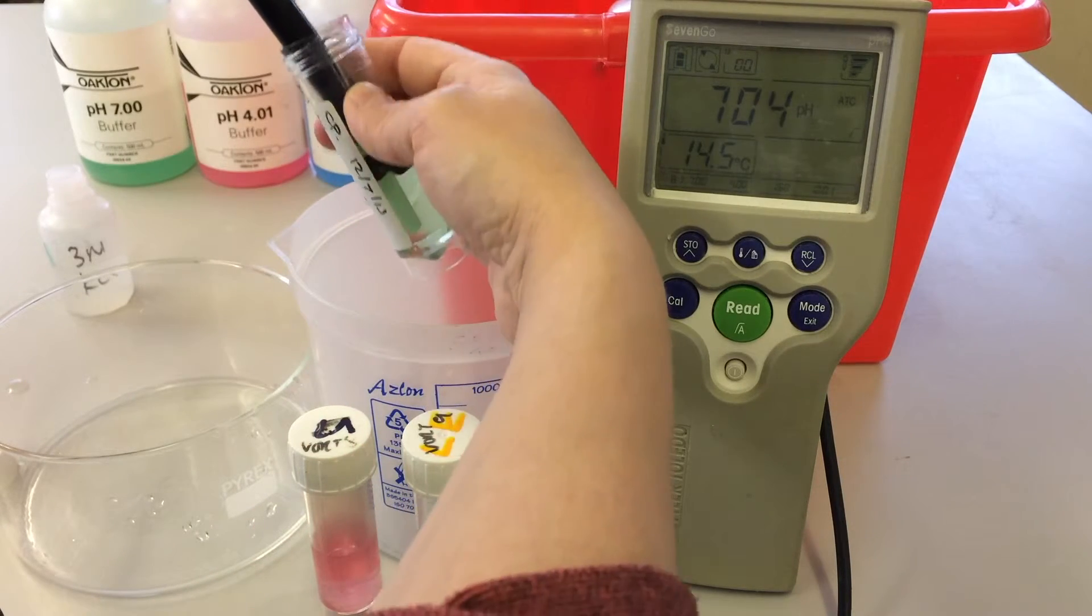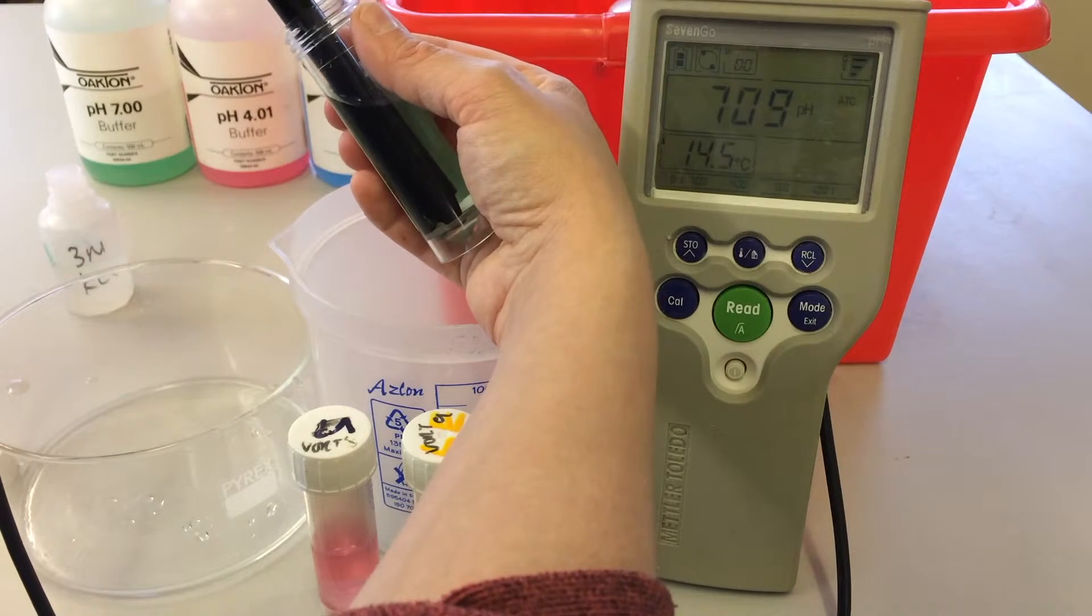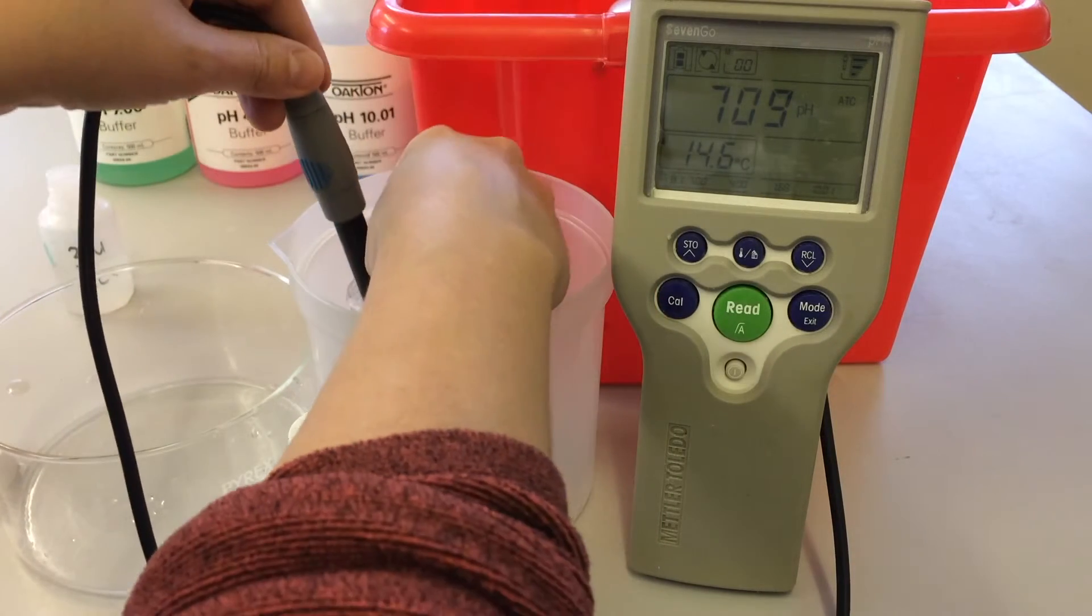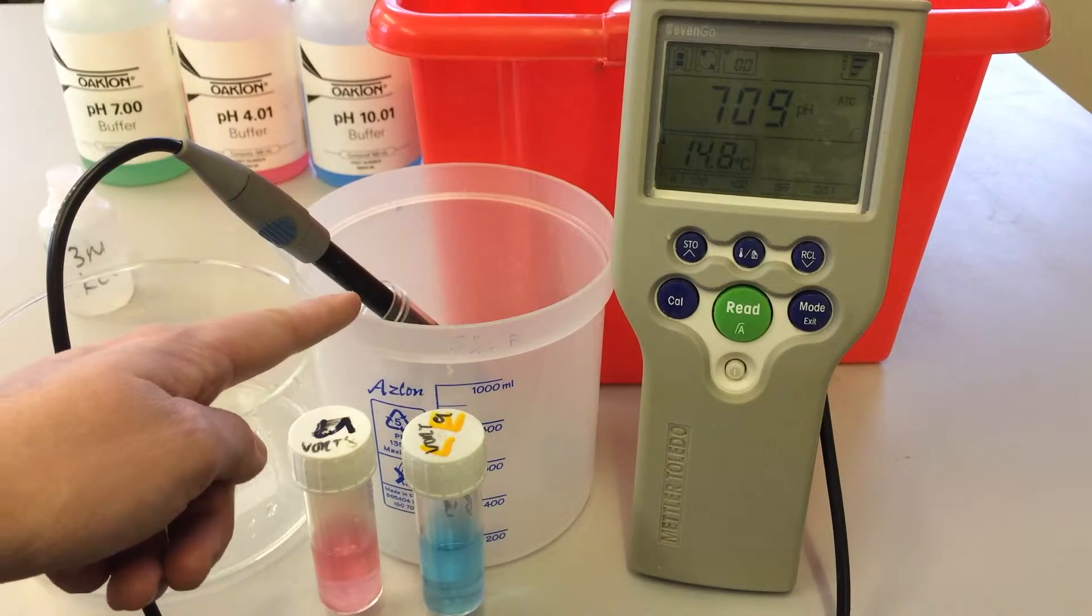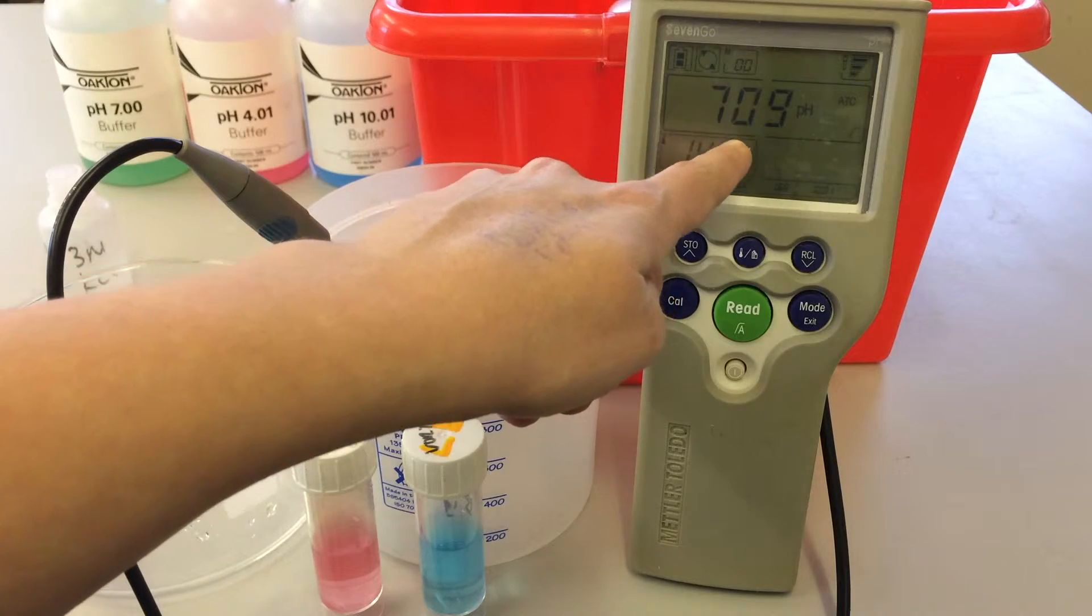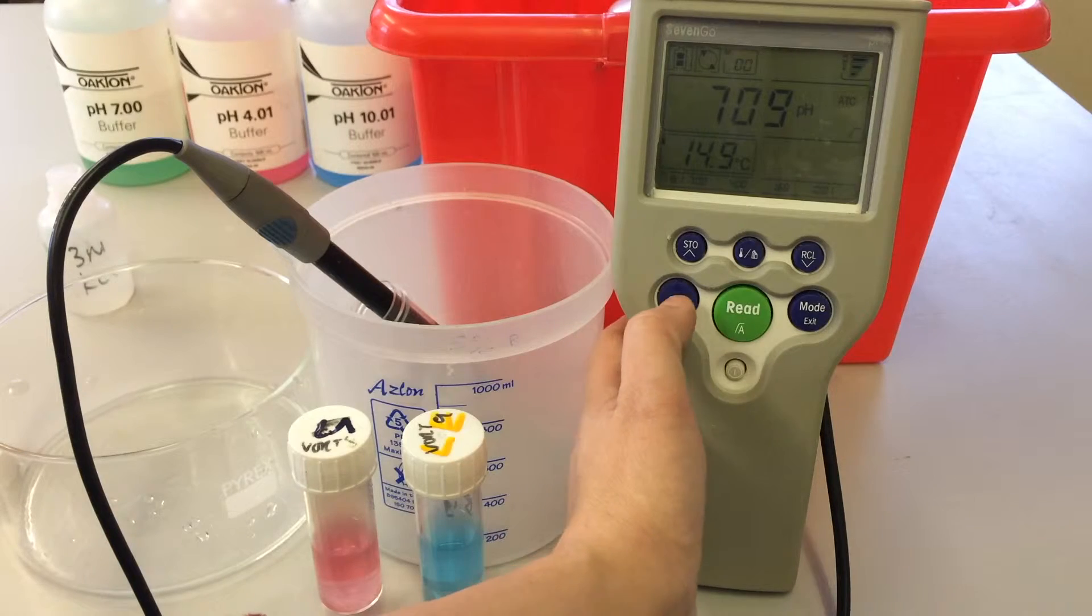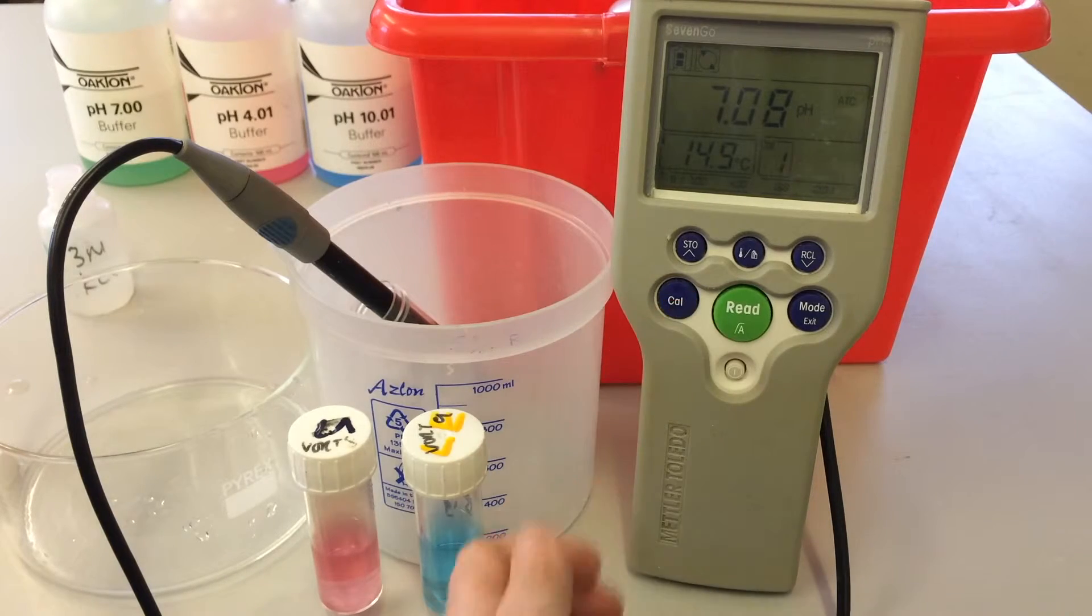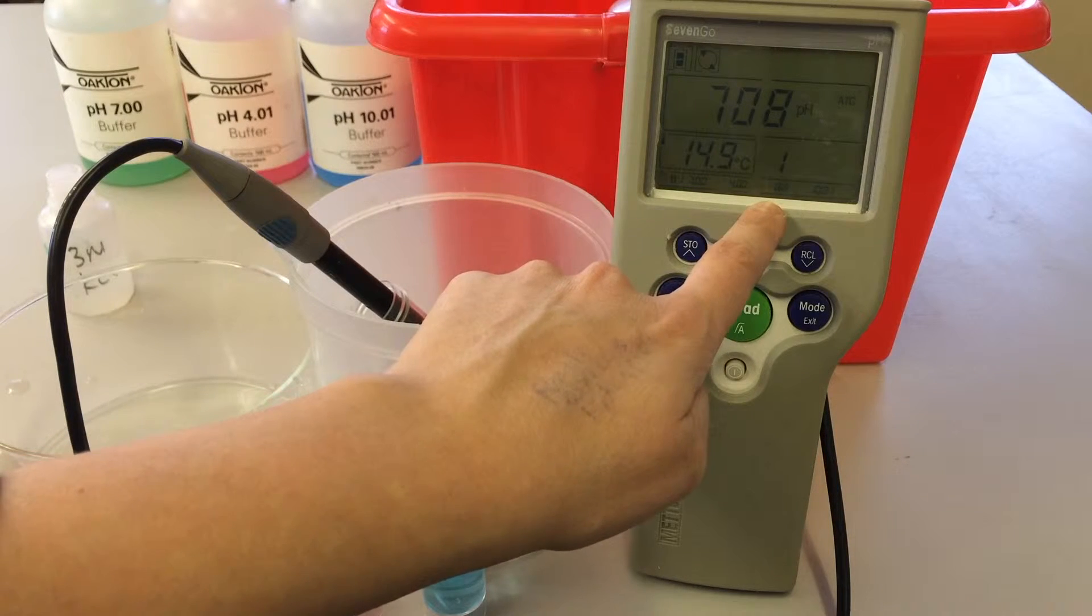When you put your probe in, give it a gentle shake to make sure you remove any air bubbles at the end of the probe there, and then place it into the beaker so that nothing spills out. You can see that pH value has already changed, but to calibrate it, all I do is simply press CAL and you'll see this flashing box saying CAL 1, so it's letting me know that I'm calibrating at the first level.